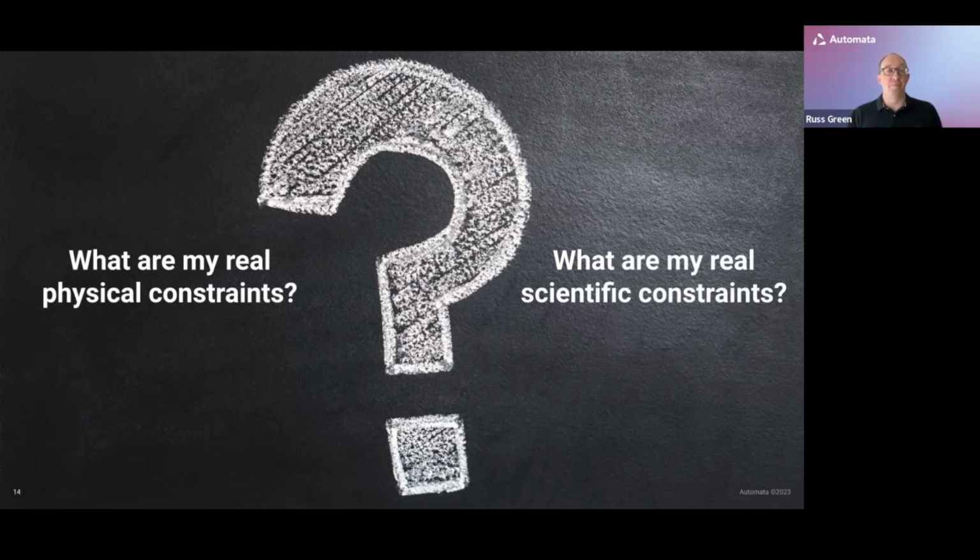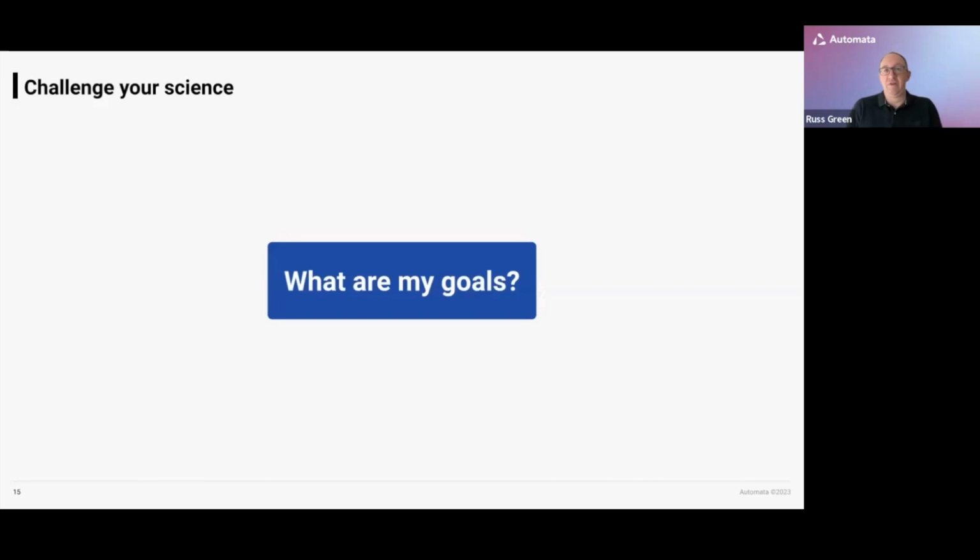The point I want to make when thinking about my real scientific constraints is that I was guilty of this, and I see this so often when we go into labs: we do things in laboratories because it's the way we have been doing it. Typically, we have an SOP that's been optimized at some point in time and we follow it, or more often than not we take that SOP and make our own slight tweaks to it. We do things like operating in those class 2 hoods because it's the way it has been done. I think we should always question that when thinking about a major transition like adoption of automation: what are my real constraints here, and when we extend that out, what are my goals? What am I trying to achieve?